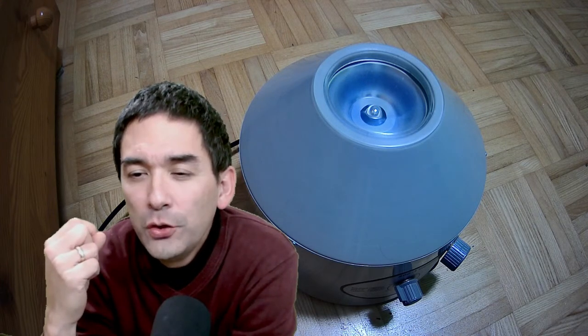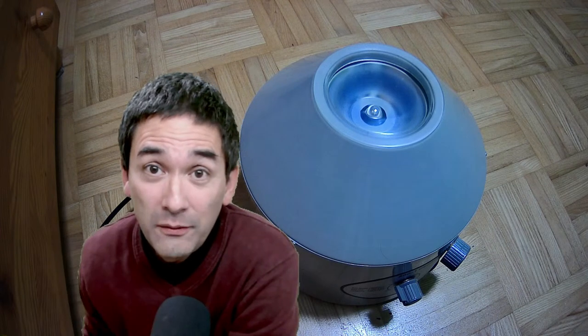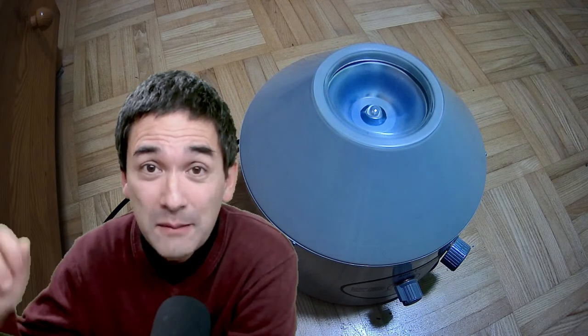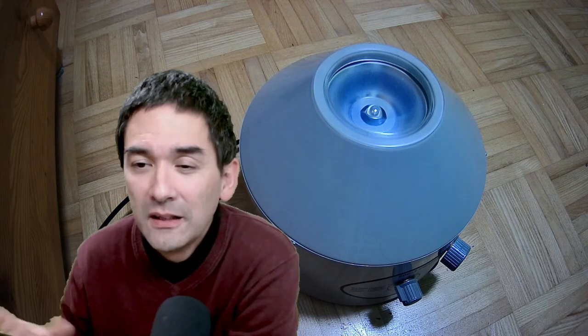Someone says they've broken tubes in the centrifuge — yes, so have I while still working in a laboratory. I was supposed to spin at 1,500 RPM which is quite low, and I accidentally spun it at 15,000 — a mistake by a factor of 10 — and broke the tubes. It's a little bit risky indeed.